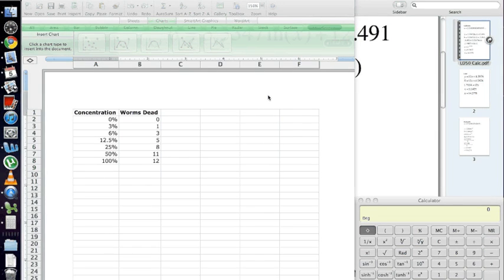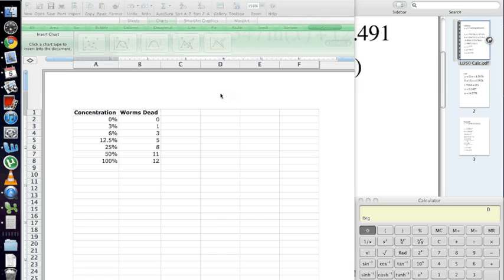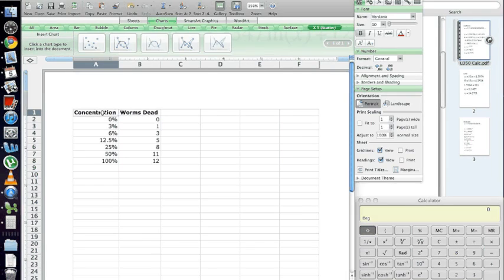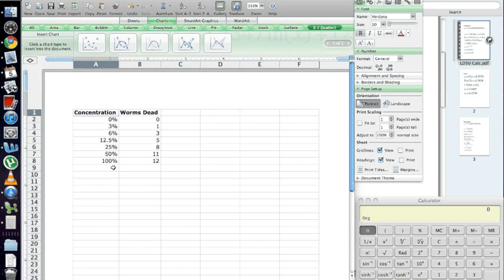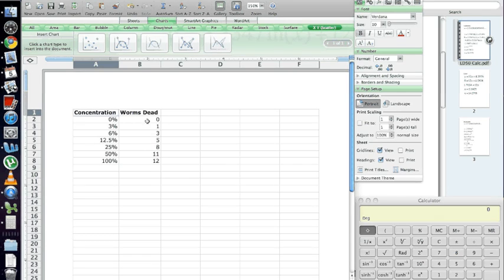Hey, I'm going to show you how I'd set up my charts for the project and how to calculate an LD50 from your data. You're going to create four graphs, one for each of the detergents you used. You're going to set up your data like this with concentration on the left-hand side, so it'll be on the x-axis, and the number of worms killed for each concentration on the right-hand side, so it'll be on the y-axis.